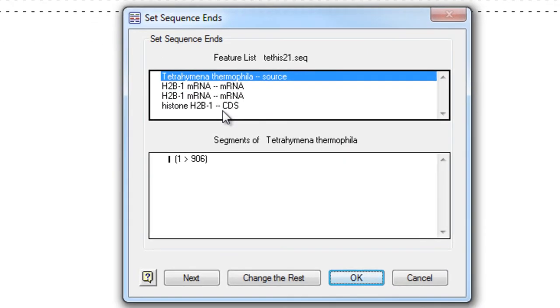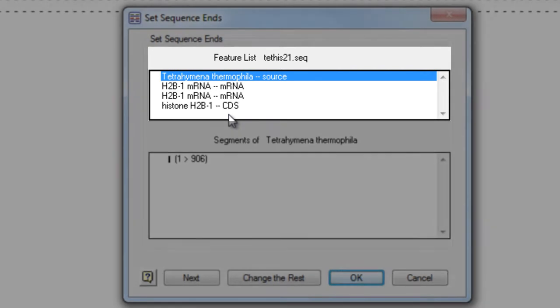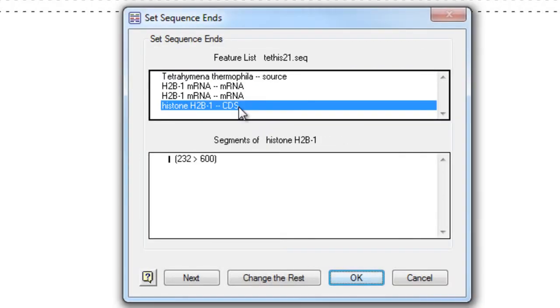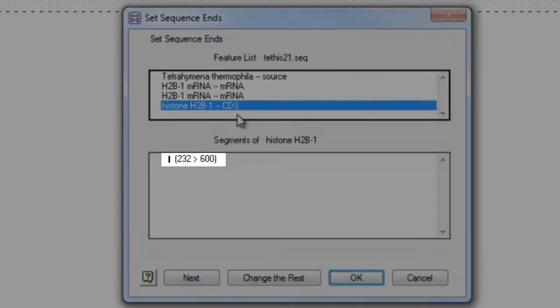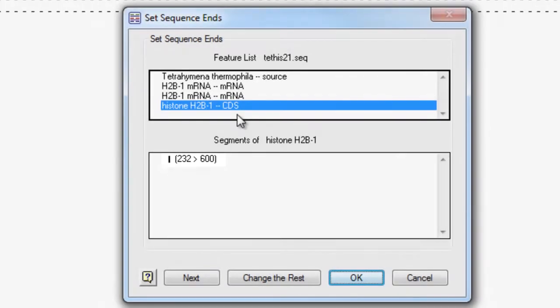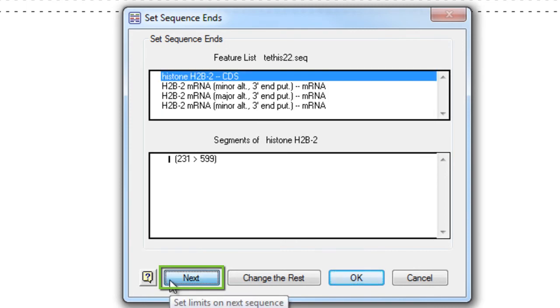This opens the Set Sequence Ends dialog. Here all of the features annotated on each sequence are listed. From here, I can choose a feature, and that shows me the range of that feature on my sequence. To limit this sequence to just those coordinates, I'll click Next, and then select the CDS feature for each of the remaining sequences.